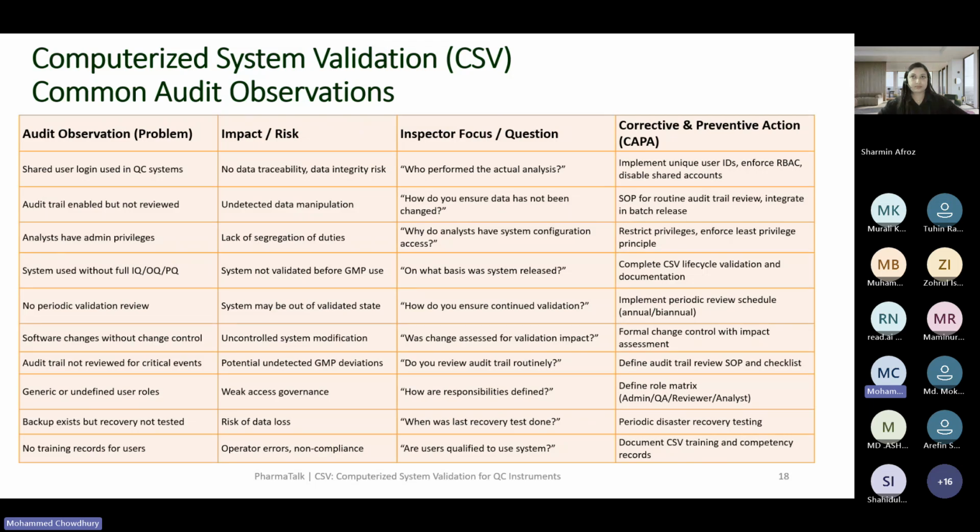In the traceability matrix, we need to cover that every URS requirement is tested in any of the documents, whether in the IQ, OQ, or PQ. The traceability matrix exactly pinpoints where the requirement is tested, and it is a very easy document to present to the inspectors to confirm that every URS requirement is tested.